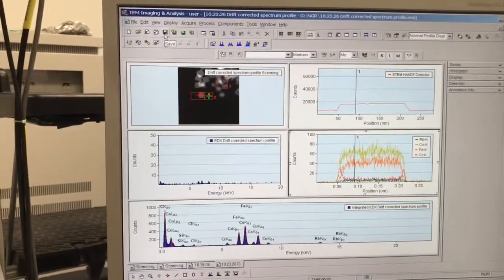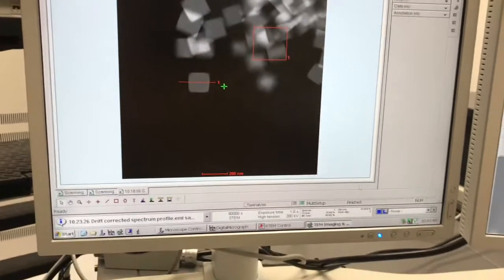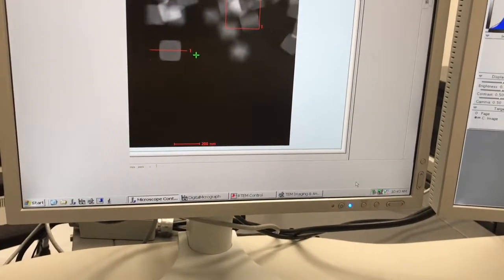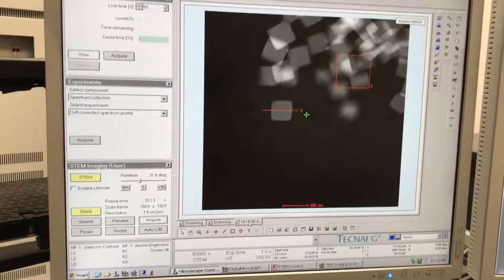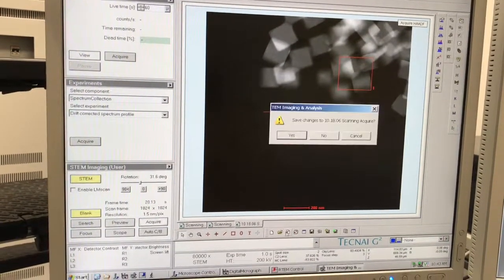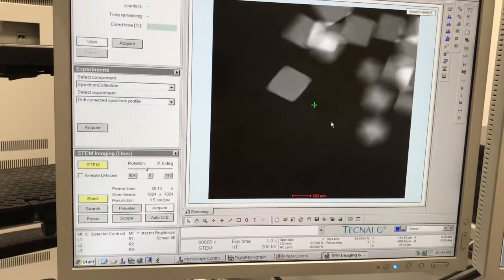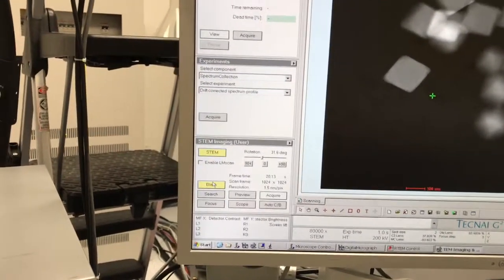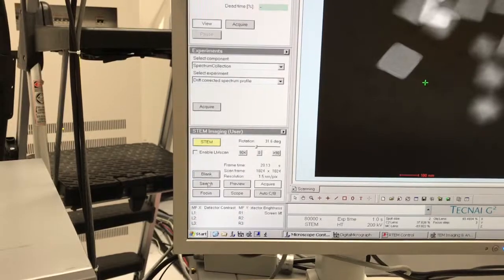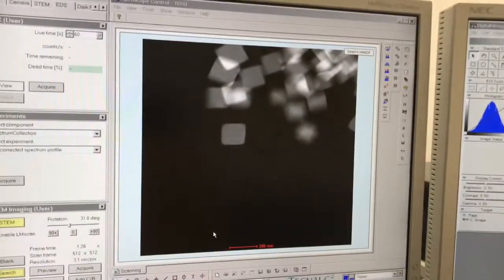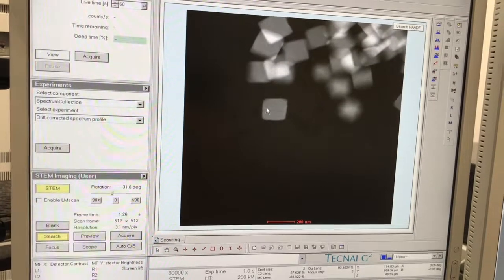Save the EMI file and close it by hitting the X button, then go back to Acquire mode. When you're done doing a profile, the system blanks off the beam when it's done, so you have to unblank and then search. You'll notice on the particle we were working on — if we zoom in — you can see a line from where we scanned across.